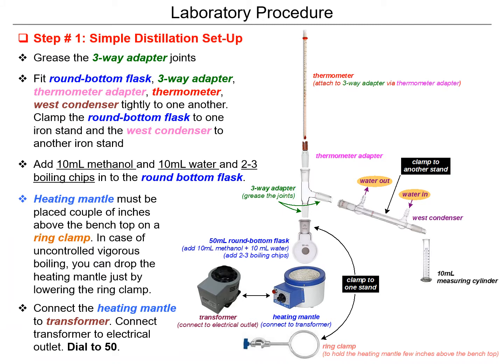The laboratory procedure starts with assembling the apparatus. To do so, you need a clean and dry apparatus. You also need to grease the three-way adapter to make it easier to remove later and to prevent cracks while tightening. Then prepare the round bottom flask, the adapter, the thermometer, the heating source, and the transformer. Hang the heating mantle over the ring clamp, put the round bottom flask on the heating mantle, then attach the three-way adapter, and to it attach the thermometer.